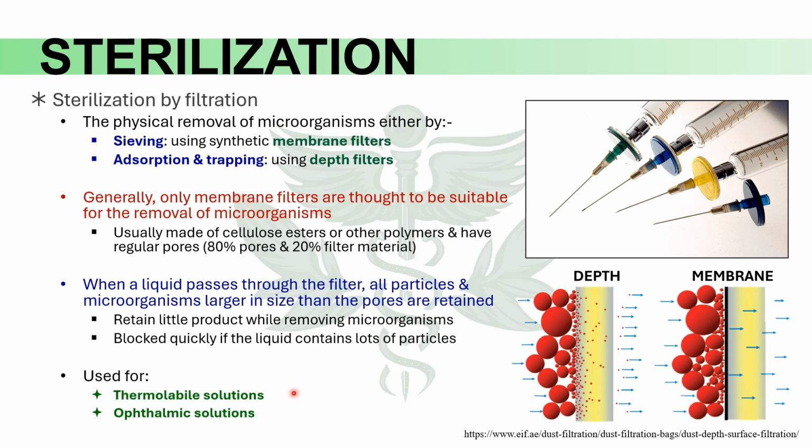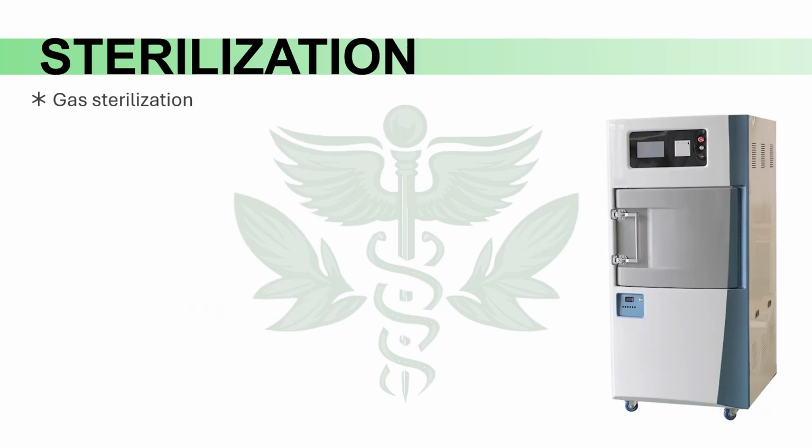We use this sterilization method for thermolabile solutions, and notice here that this is an advantage it has over dry heat and steam sterilization techniques. We can also use it for ophthalmic solutions.